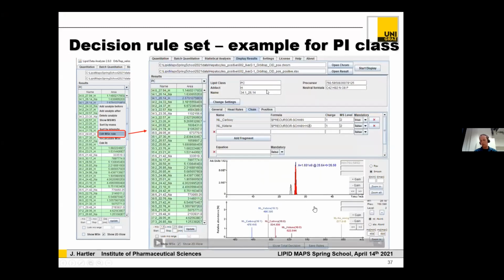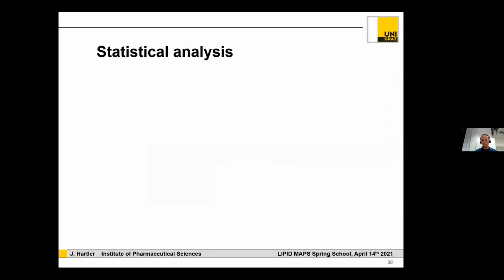You can easily try to develop your own rules. You have a graphical user interface, and you can do this for any additional lipid classes, and many of the users of the LDA do that. So now let's get to the next part.